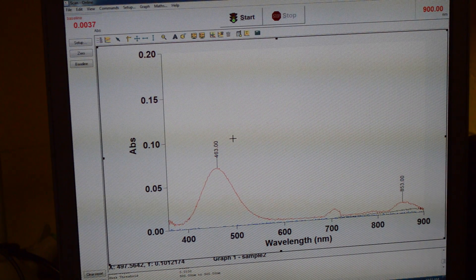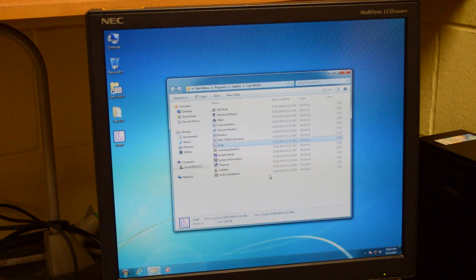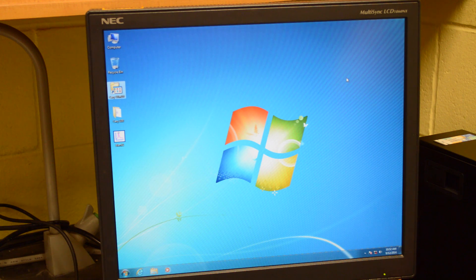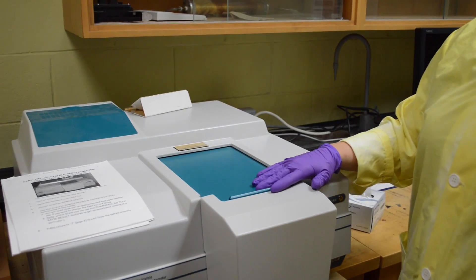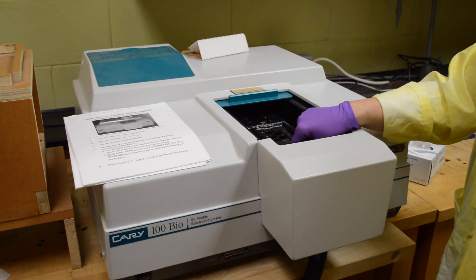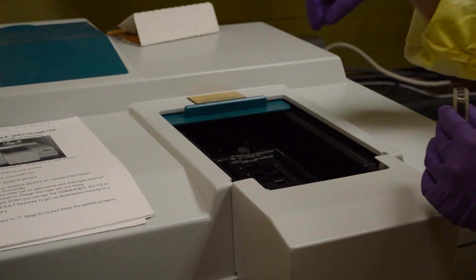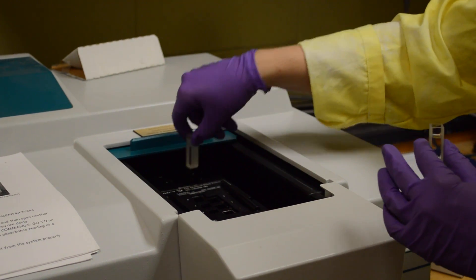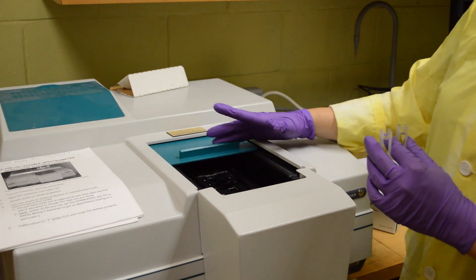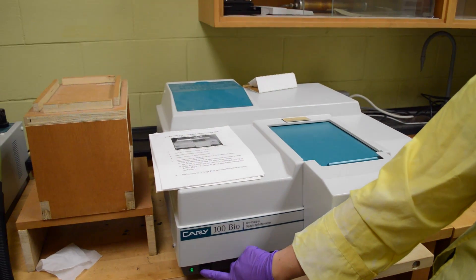To turn off the system, you're going to exit out of the software and you're going to press OK and exit out of here. You're going to turn the computer screen off. Then we are going to go over to the UV-vis spectrometer. You are going to open the lid, lift the silver button that we discussed earlier to eject the samples. You're going to take each cuvette out and you're going to slide the lid shut. From here you just turn off the spectrometer by clicking this button here.